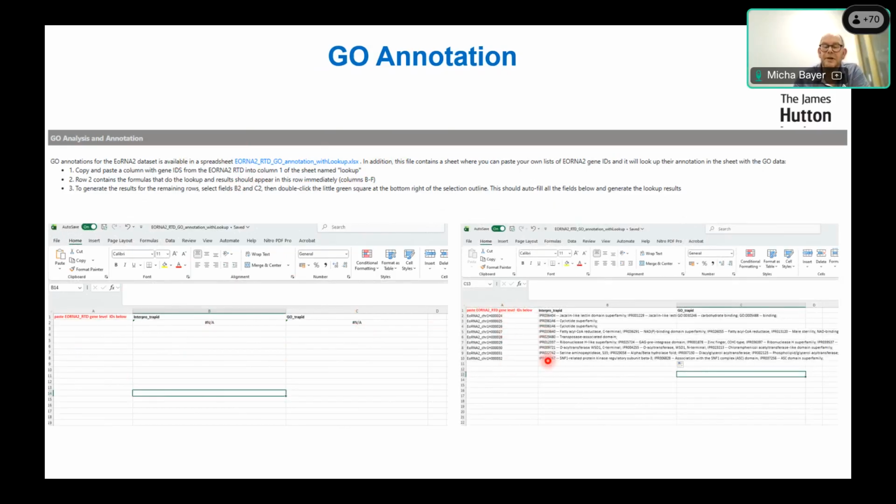This gives basically the InterPro TRAPID identifier tags, and it'll give you some annotation. So this will give you some idea of what sort of gene that you're working with.